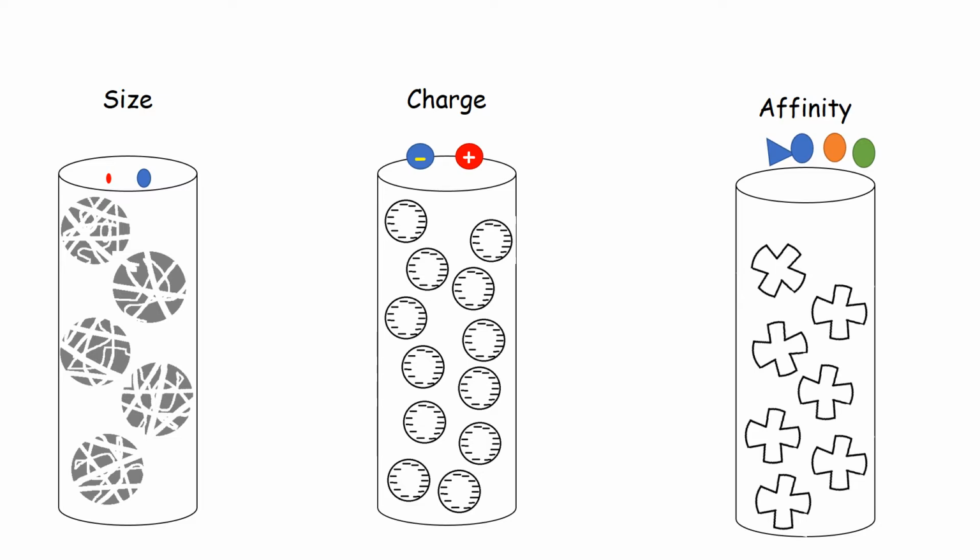With ion exchange chromatography, we separate by the charge on the protein. We can use a negative charge resin to grab positively charged proteins, and positively charged resins to attract and separate negatively charged proteins. We can also use affinity chromatography with a tag bound to the protein, like a his tag, which can then separate tagged proteins from non-tagged proteins. The his tag, or another tag that is used, can be removed in a later step in the purification process.